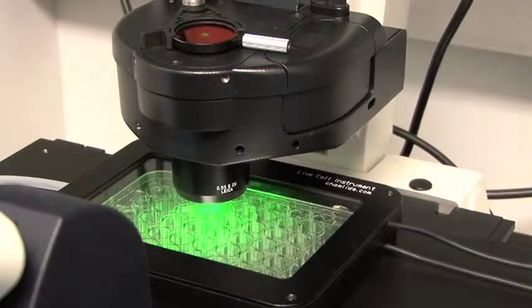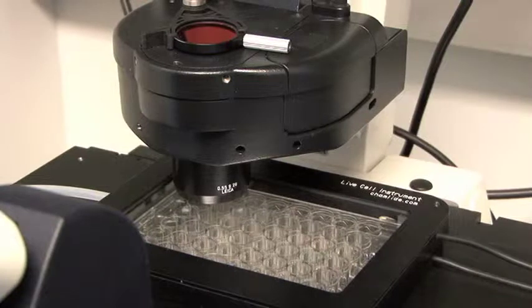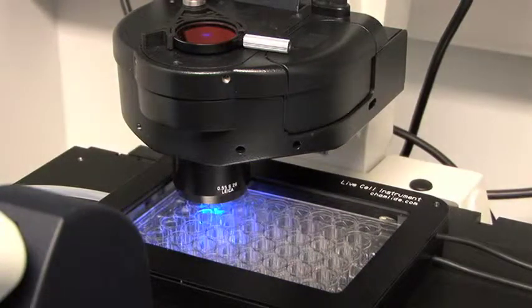The time-lapse microscope uses different wavelengths to capture images of the fluorescent cells. This allows researchers to track the satellite cell's movements. A better understanding of satellite cell movement is important for both basic science and understanding degenerative muscle disorders.